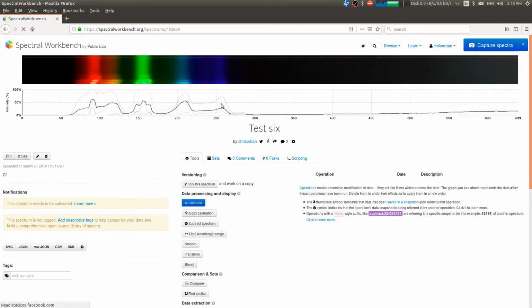And so there you go. So it is showing a line out of, it's taking this picture and this gray line here, and giving me the intensity of these various lines. Now the goal of this is to take these pixel values here and turn them into nanometers.